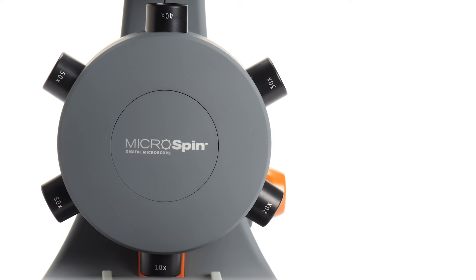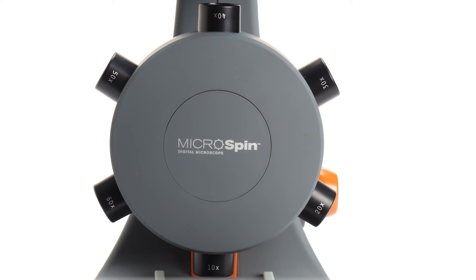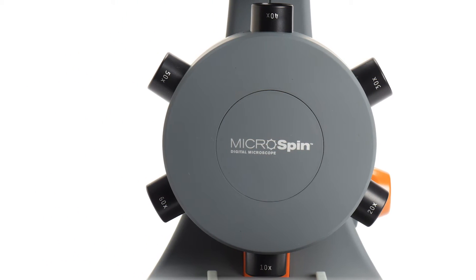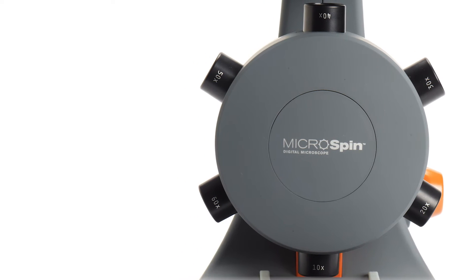The 2 megapixel CMOS imaging sensor provides an additional 10 times magnification for a total magnification of 100 to 600 times.